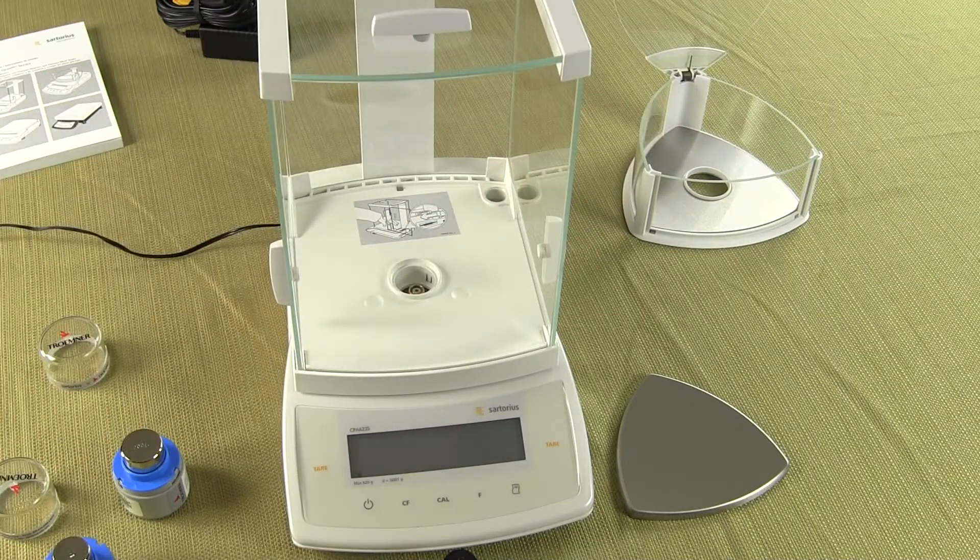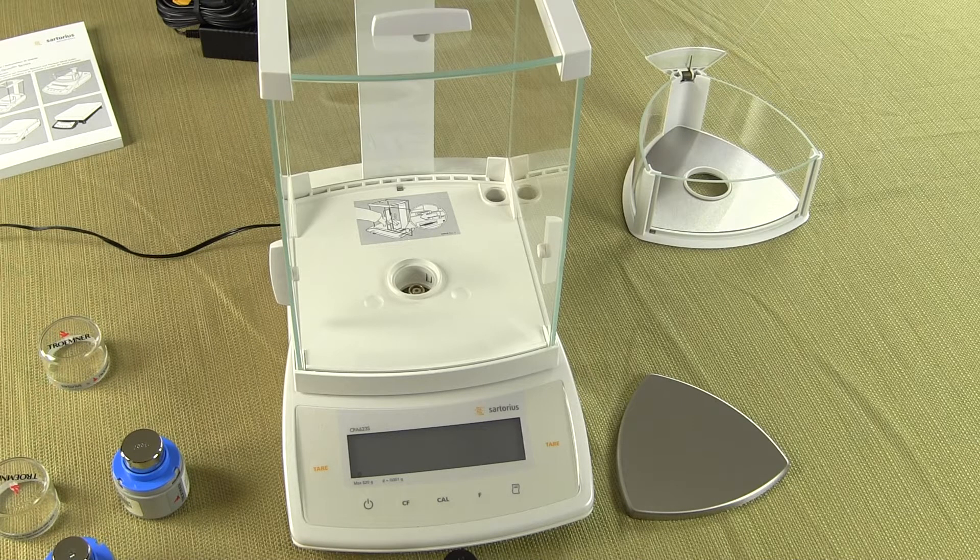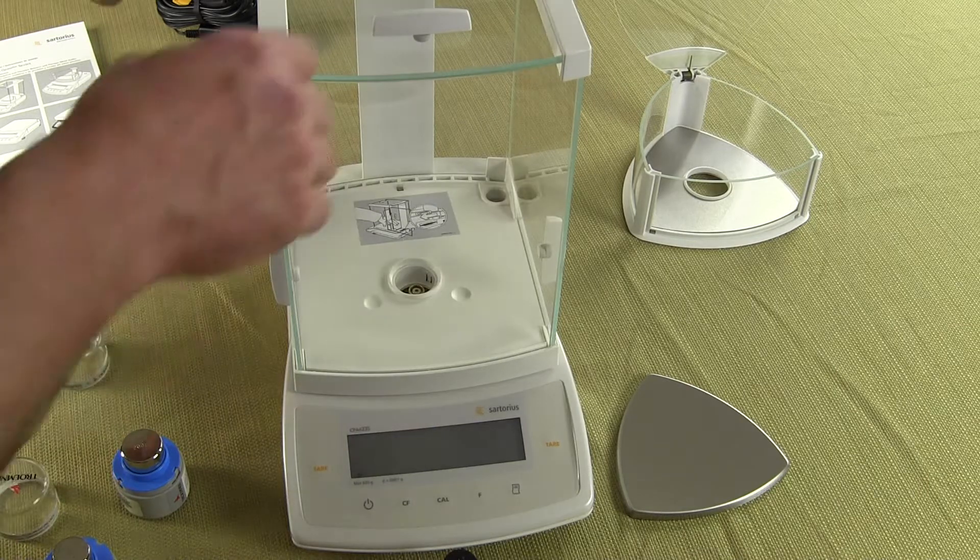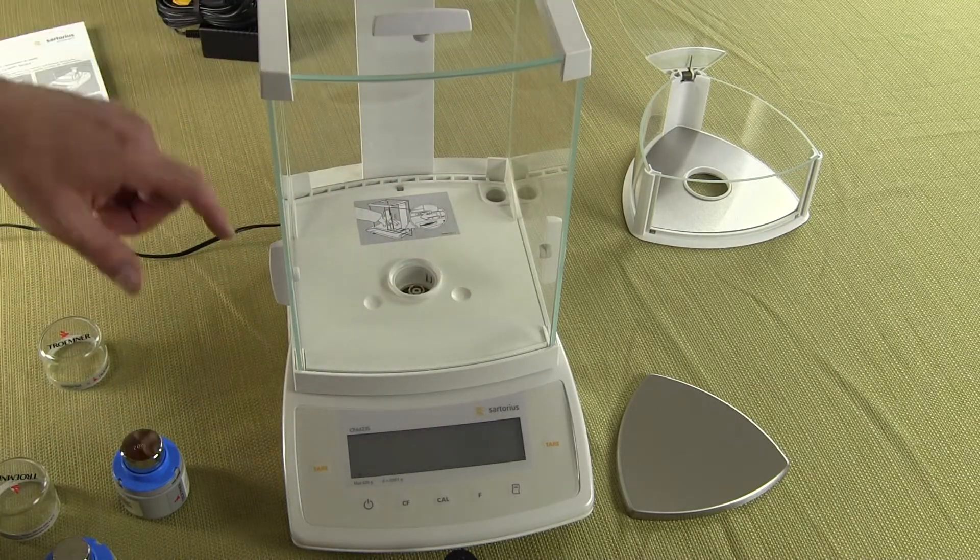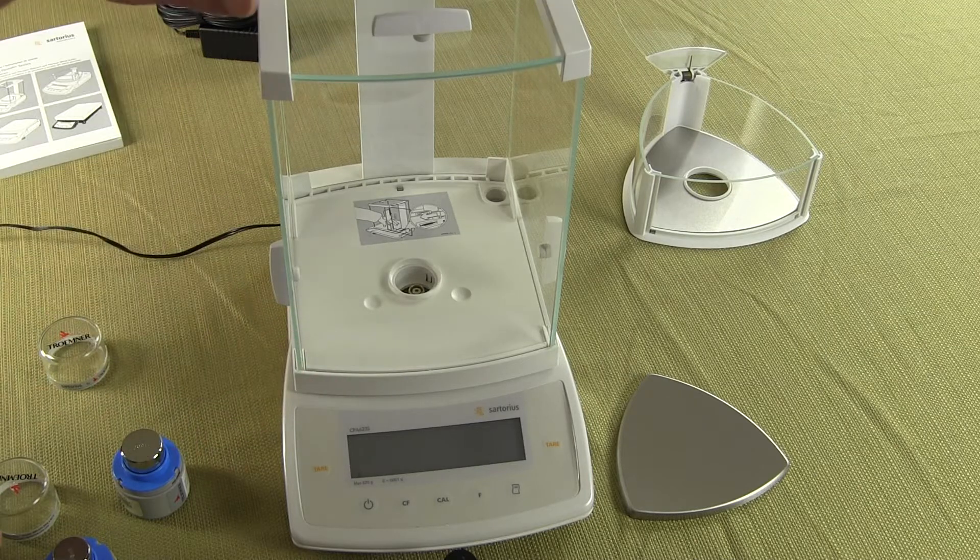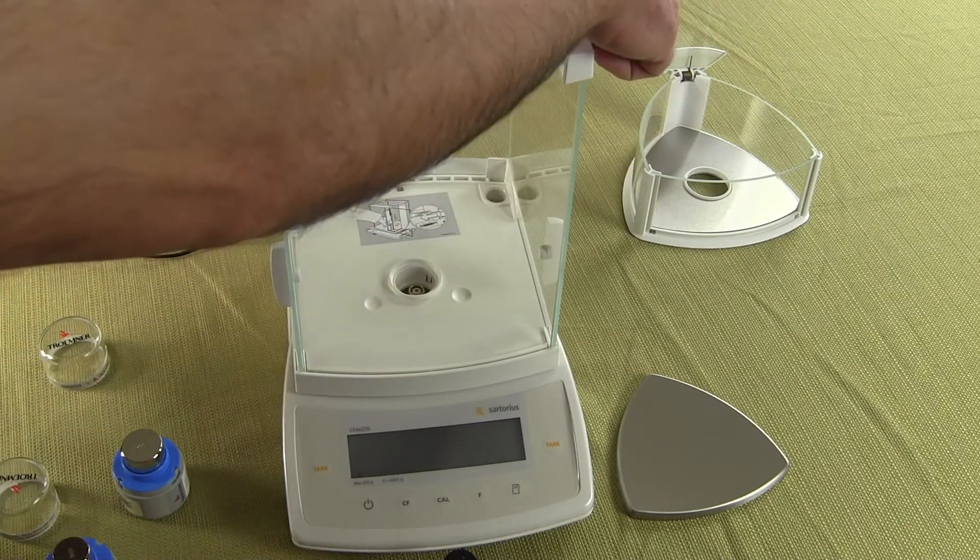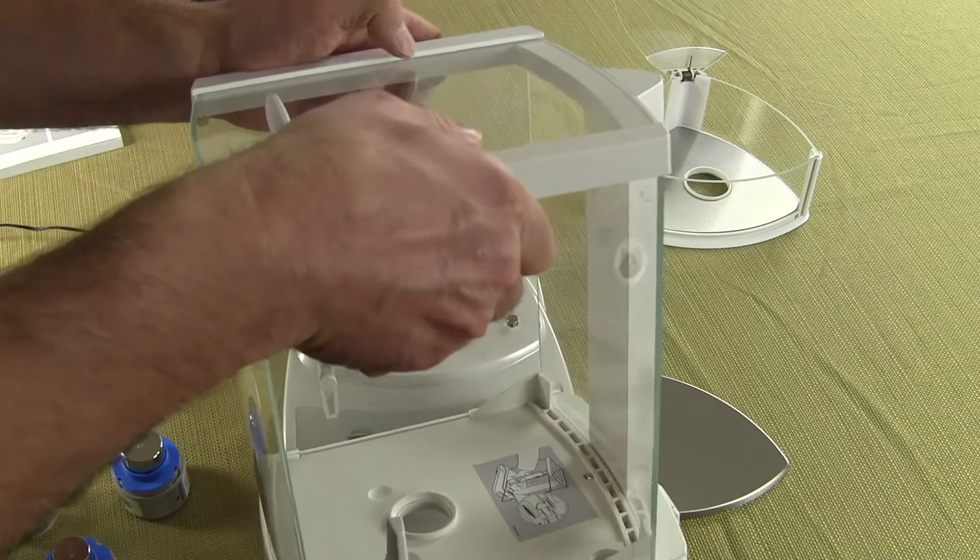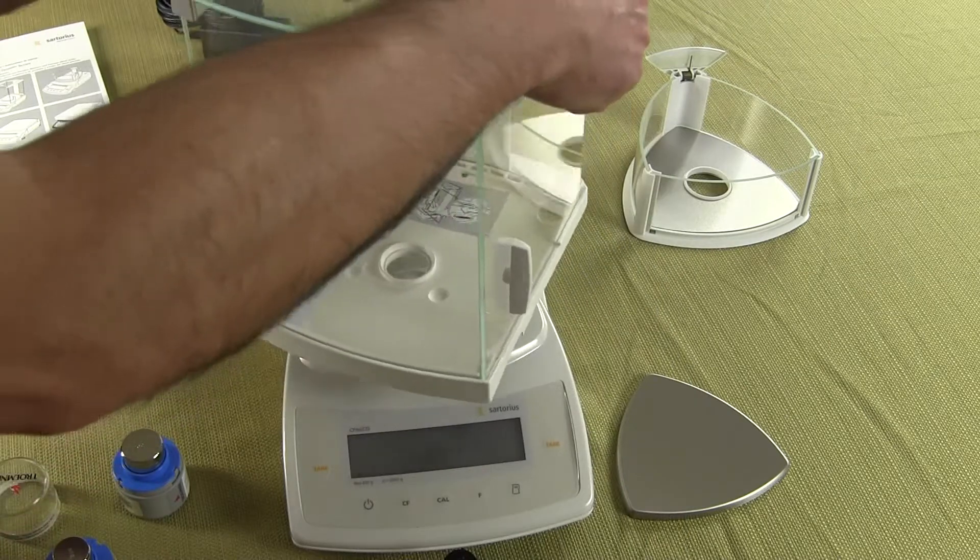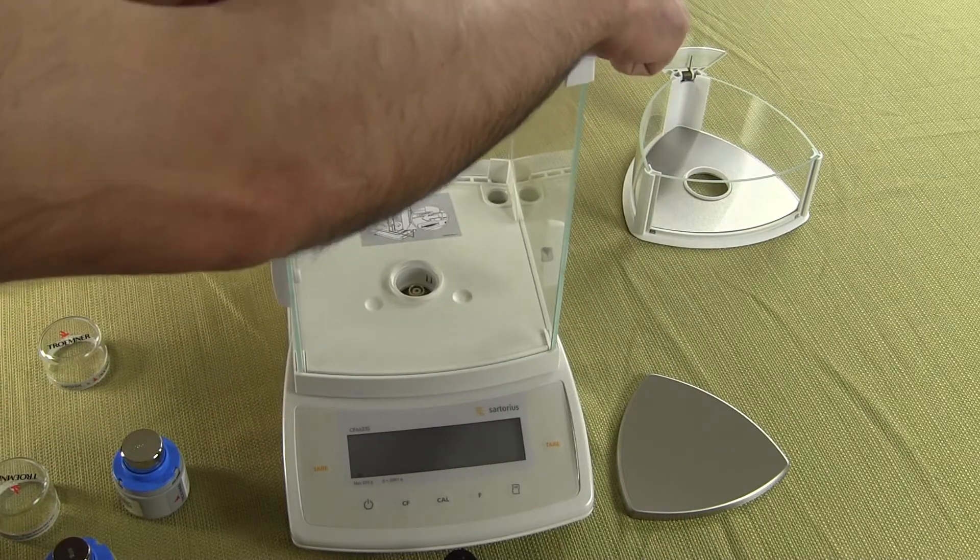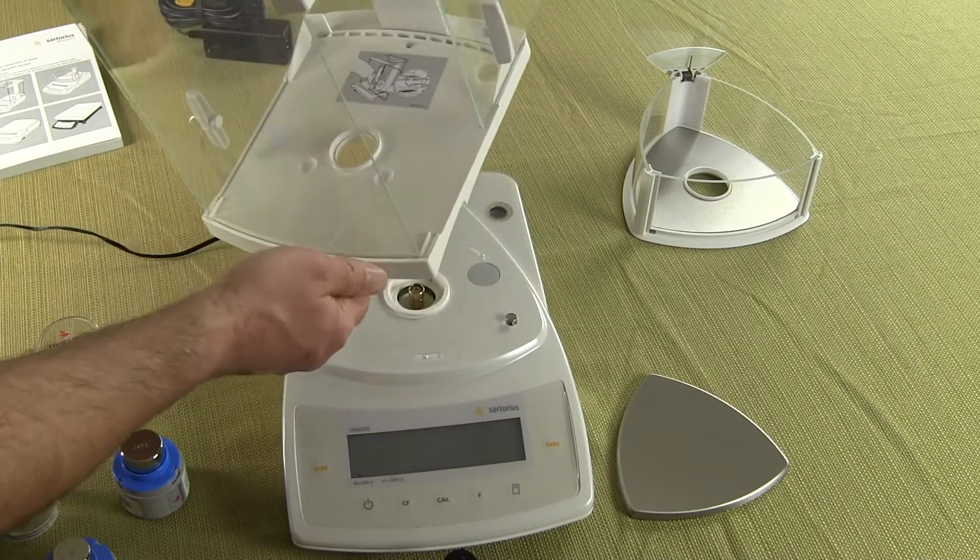So this here is the optional draft shield that Sartorius offers. The exact part number on this optional square draft shield is a YDS01CP and this is going to give you basically 9.37 inches from the top of the weigh pan to the top of the glass draft shield. So this guy here, this is your optional square draft shield and it works the same way basically on the bottom of this draft shield. Now again this is an optional accessory, I just wanted to show it to you.